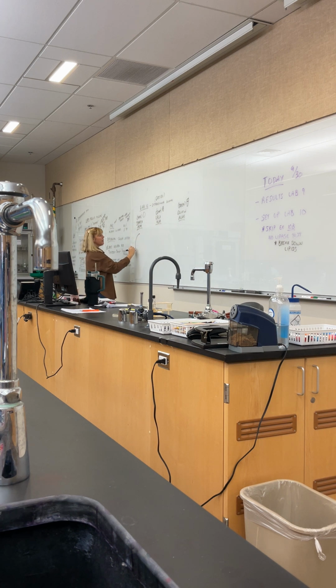So I'm going to take a plate and I'm going to do exactly what I did last time. I'm going to put a line. I'll have E. coli on one side. I'll have Bacillus subtilis on the other side. And I'm going to do a fishtail. So remember how we do that. We do a straight line down and then a squiggle. And a straight line down and then a squiggle. Making sure we don't touch the edges or the other bacteria. Okay, so that's what we're going to be doing for our starch plate.